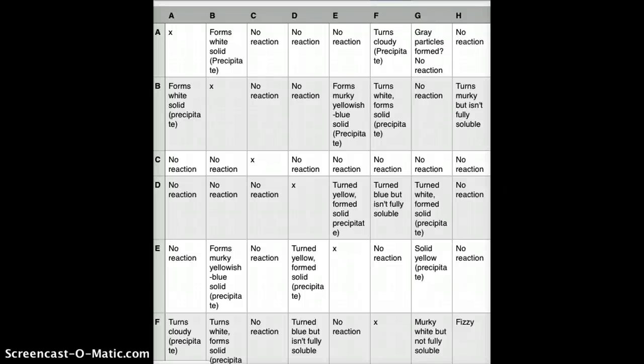The purpose of the Unknown Solutions Lab was to determine the identity of 8 unknown substances through how they react with each other. To complete this lab, my partner and I took one of the unknown substances at a time and mixed it with the other 7 to see how they reacted together. We repeated this process until each of the individual substances were mixed with every other one.